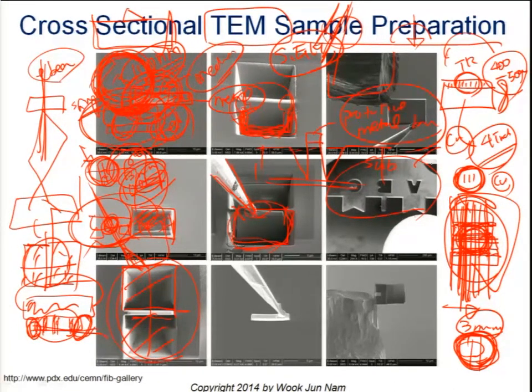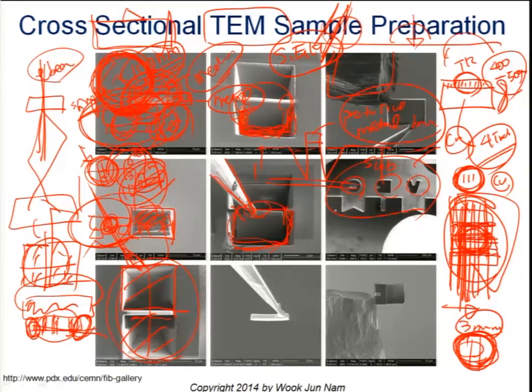And then this kind of copper grid is designed for this focused ion beam process, and even has identification numbers or characters for each port.